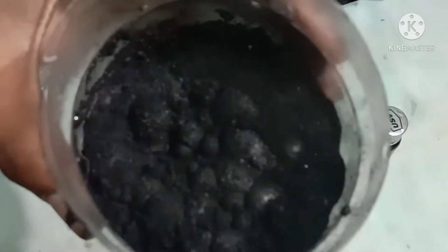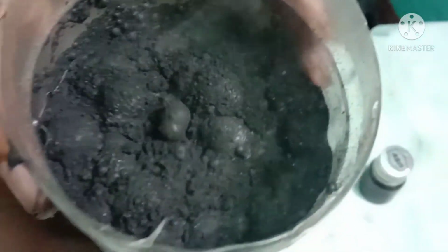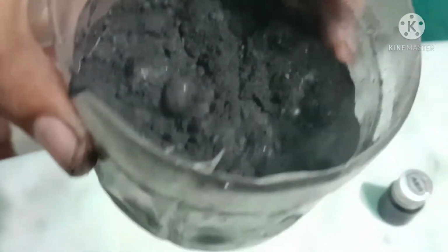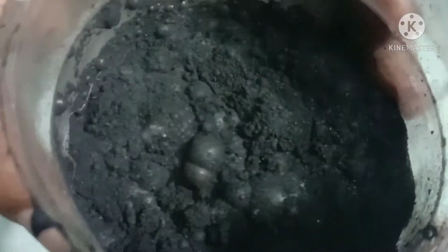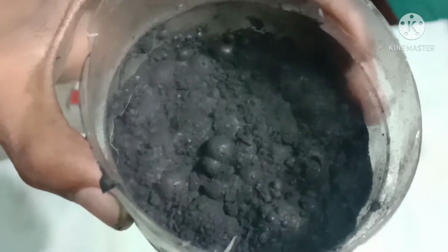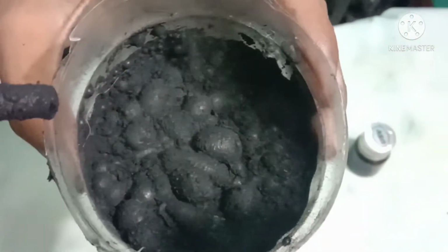And the smoke, and it is an exothermic reaction. And the jar is getting hot, and smoke is coming out. It's very hot. You can see that bubbles are coming out, and the jar is getting hot.